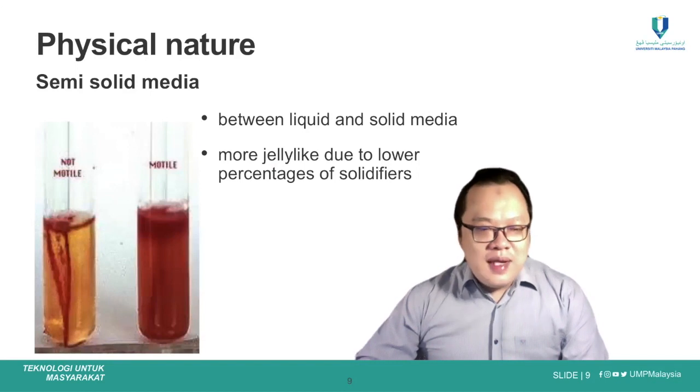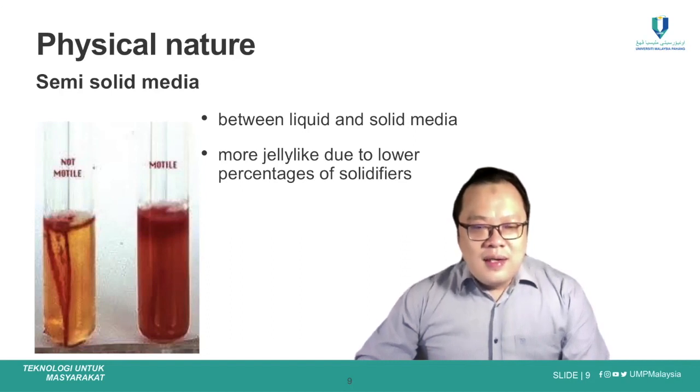As you can see from here, this is a type of gelatin agar that is used for testing motility of bacteria in the semi-solid agar media.